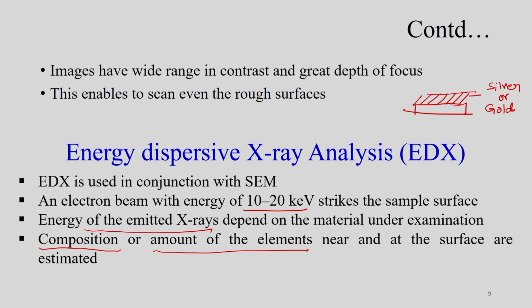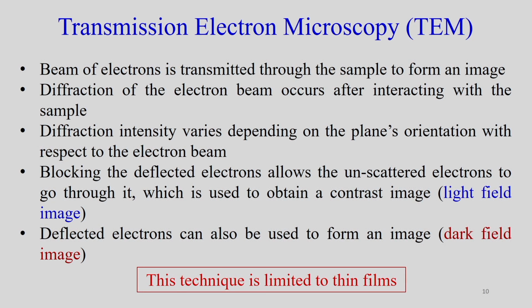So, in this way mostly the SEM is coupled with the EDX. So, it is giving two information, morphology and elemental analysis. So, after the SEM, next is the transmission electron microscopy.